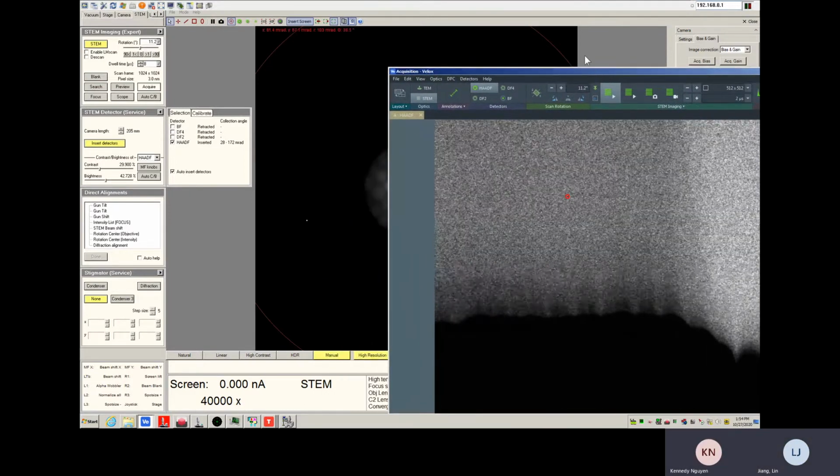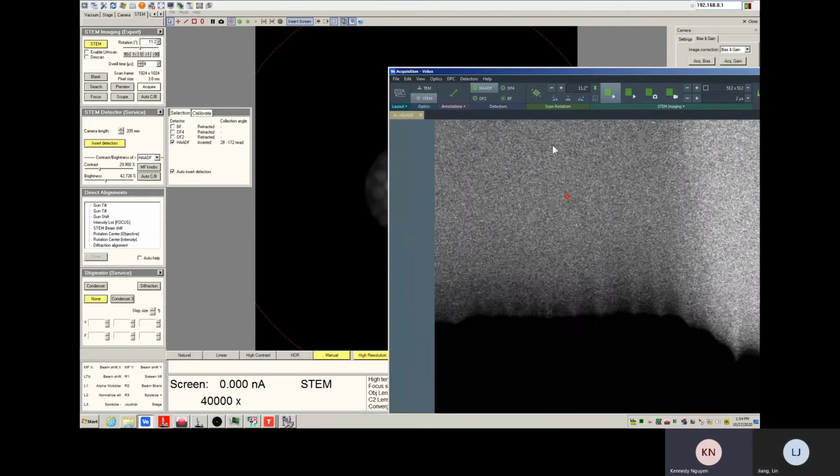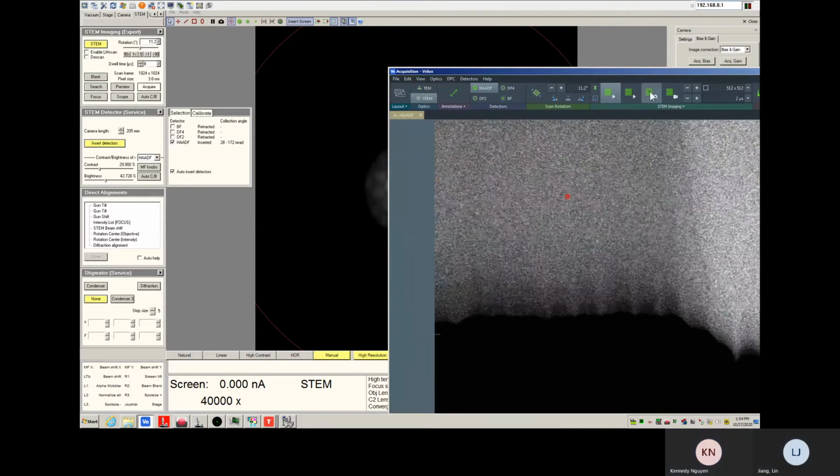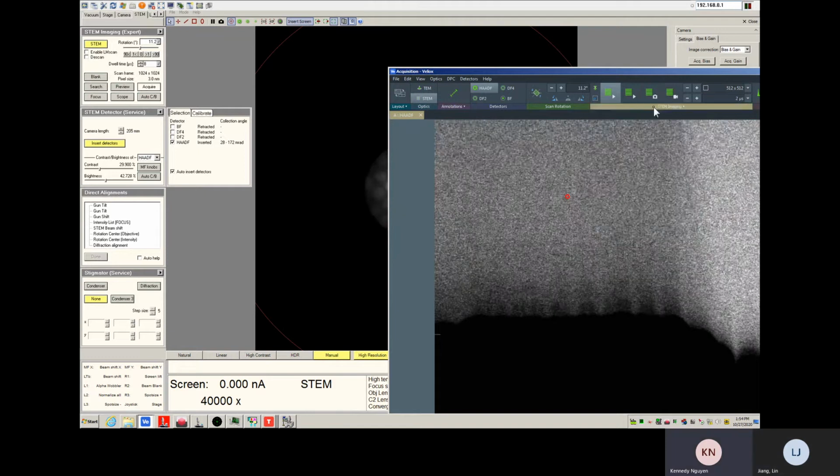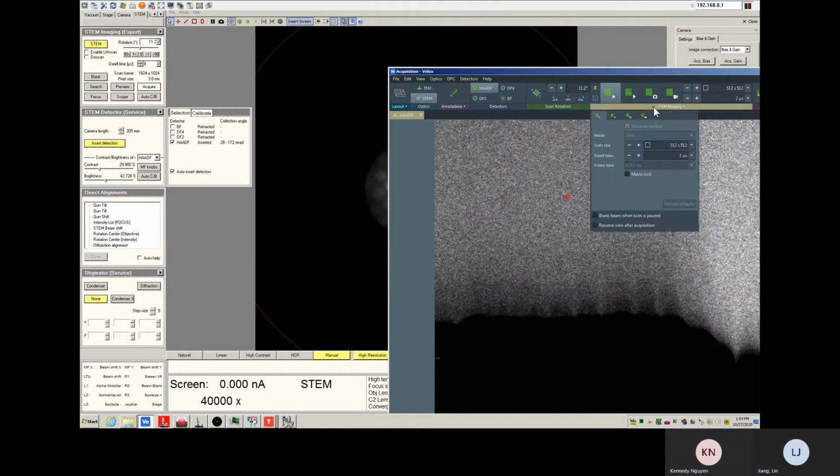This is a good one. Okay. I guess we just take a normal picture. Okay. It should be okay.